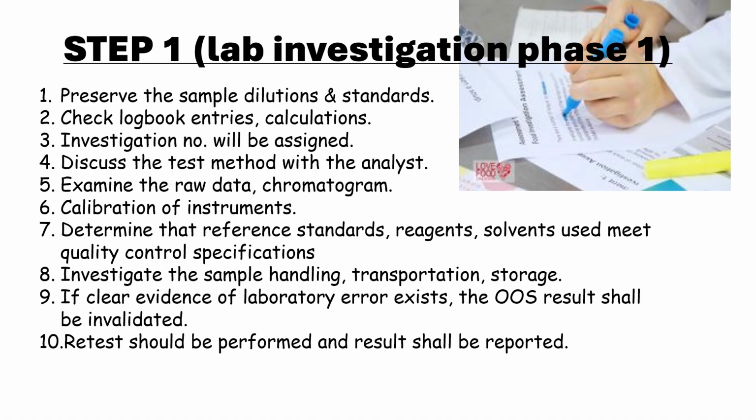If it was a refrigerated storage sample, was it kept in refrigeration condition, or if it was in a room temperature storage condition, was it packed properly, was there any leakage? So all these parameters that can contribute to the final result should be checked and verified.